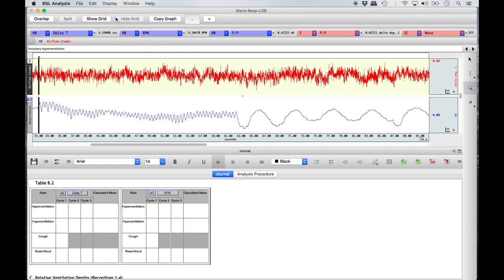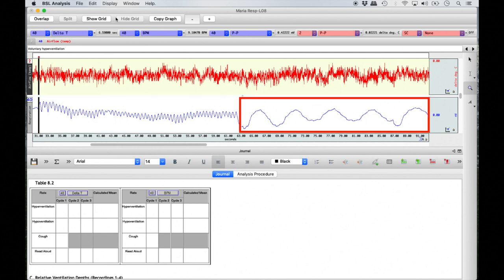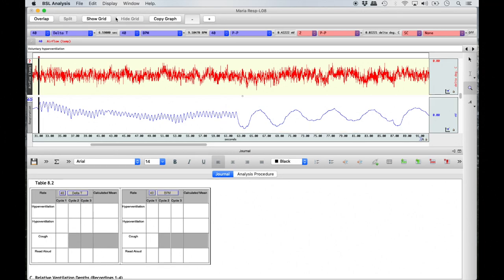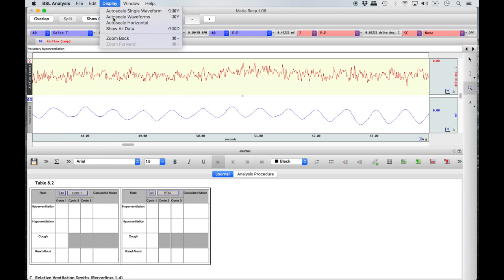Select Display and then Auto Scale Waveforms for the best view. If the experiment was recorded correctly, the first 30 seconds of the hyperventilation recording is when the subject was hyperventilating, and the last 30 seconds is when they were returning to normal breathing. If necessary, you may zoom in further to the hyperventilation portion by dragging a smaller box over the beginning half of the hyperventilation recording and again auto-scaling the waveforms.